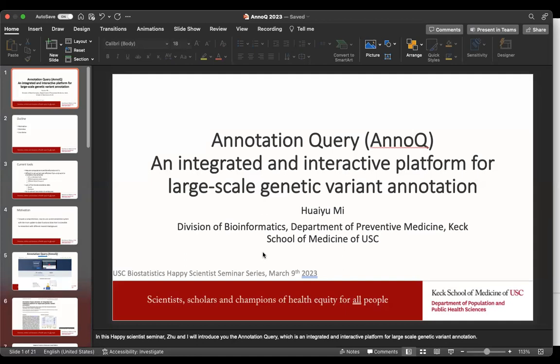think variant discovery is one thing through sequencing, like germline. The key here, though, is to use this database. It's from the Haplotype Reference Consortium, so it's limited to the 39 million SNPs that have already been discovered and called from that data set, right? That's true. So you're saying called variants, and there are tools to do that. There are scripts. I don't know if I have a good answer to that, but I know there are GATK. Yeah, GATK, I heard about those tools, but I never used it.